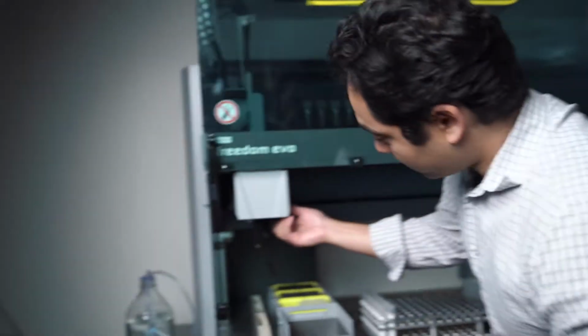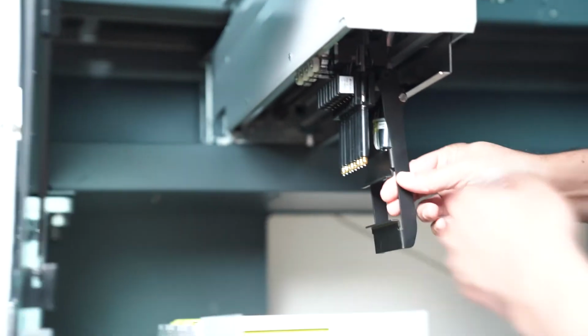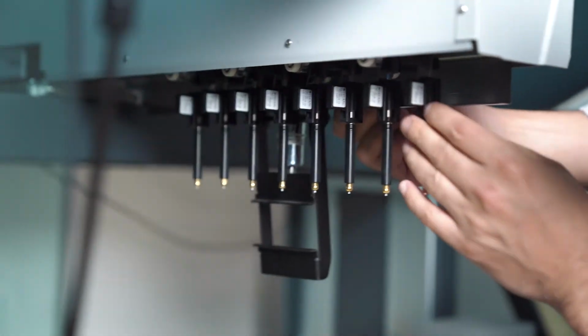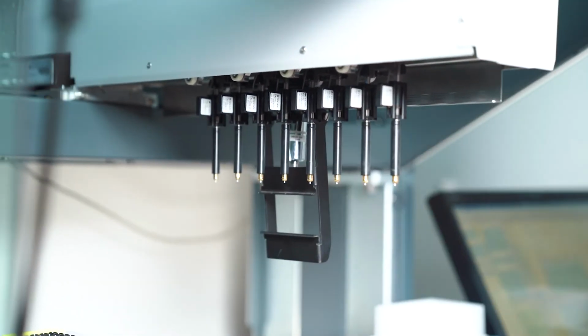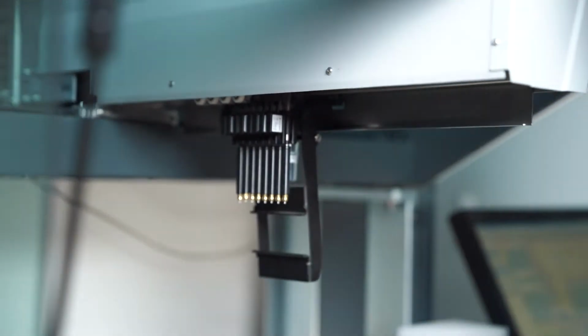What I mean by span 8 is, if you look over here, and we'll just turn this off for the time being, if you look here, this thing spans, see? Span 8, spans, okay? So that means when it can span like that, it can go into all the tubes and pipette all simultaneously. So that's the big advantage, right? If it were fixed, you wouldn't be able to do that.